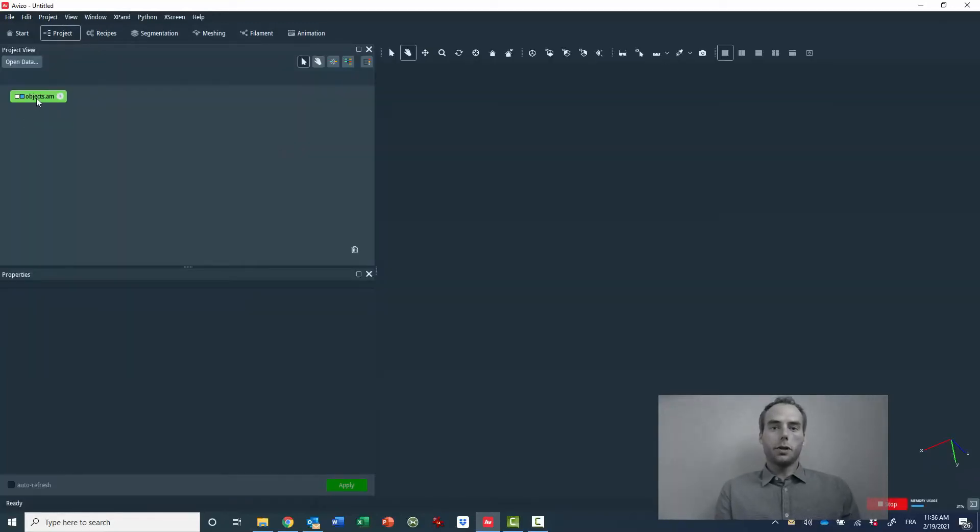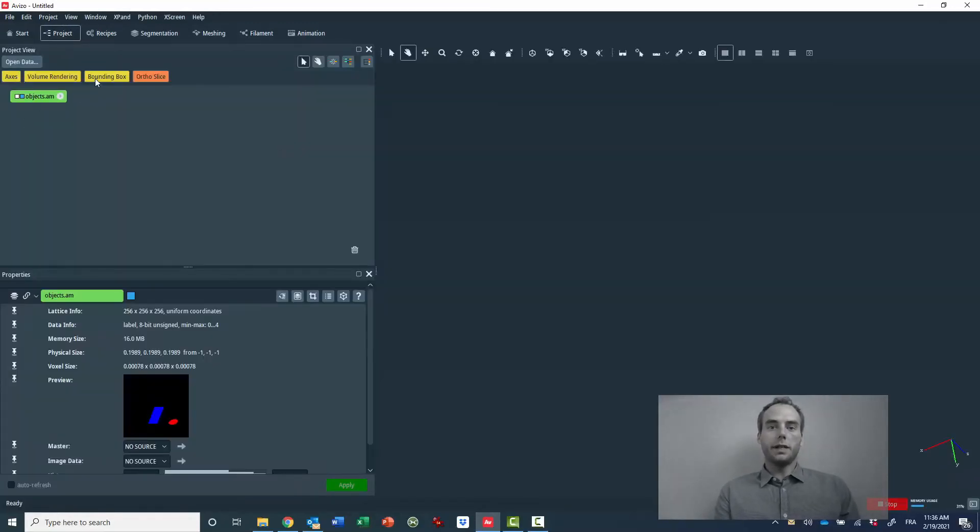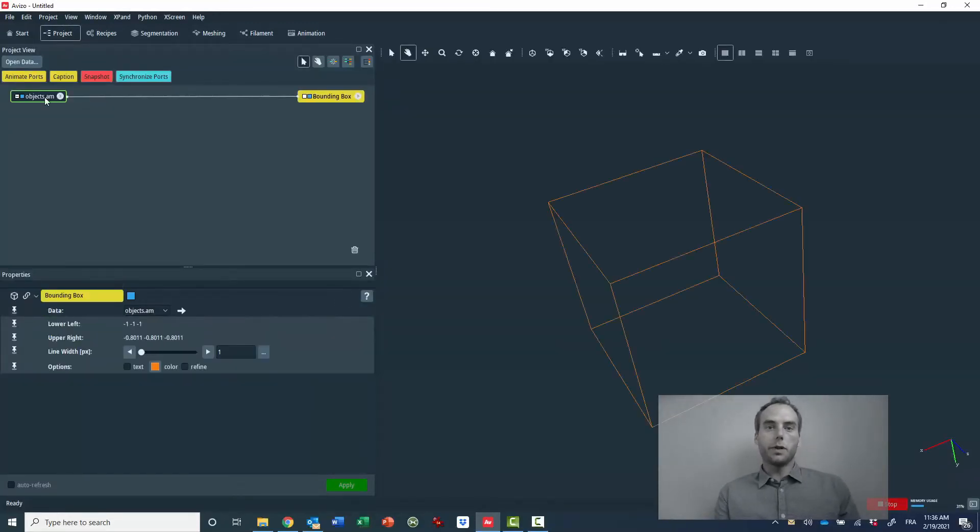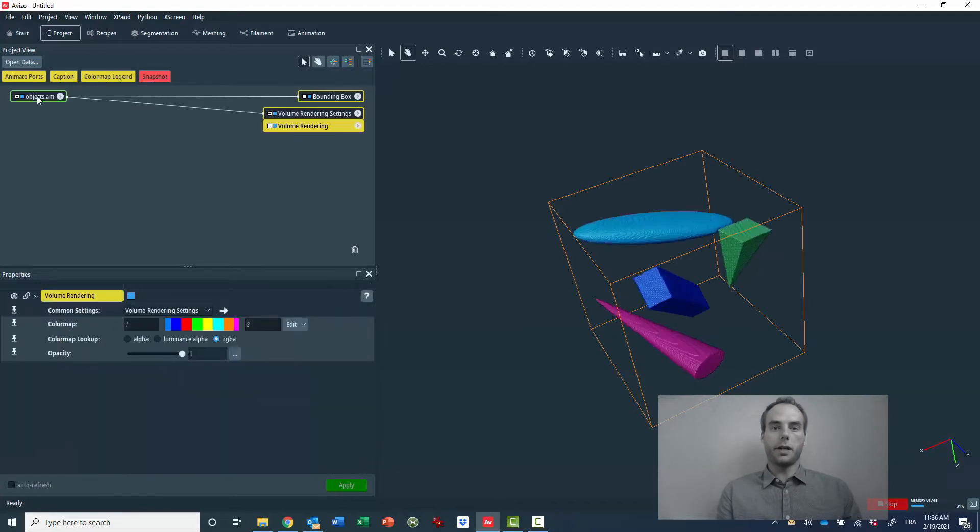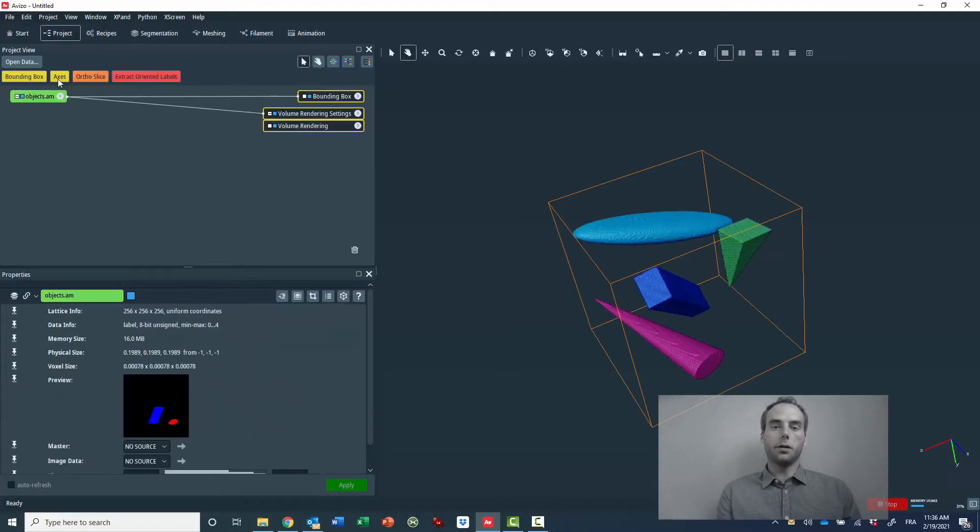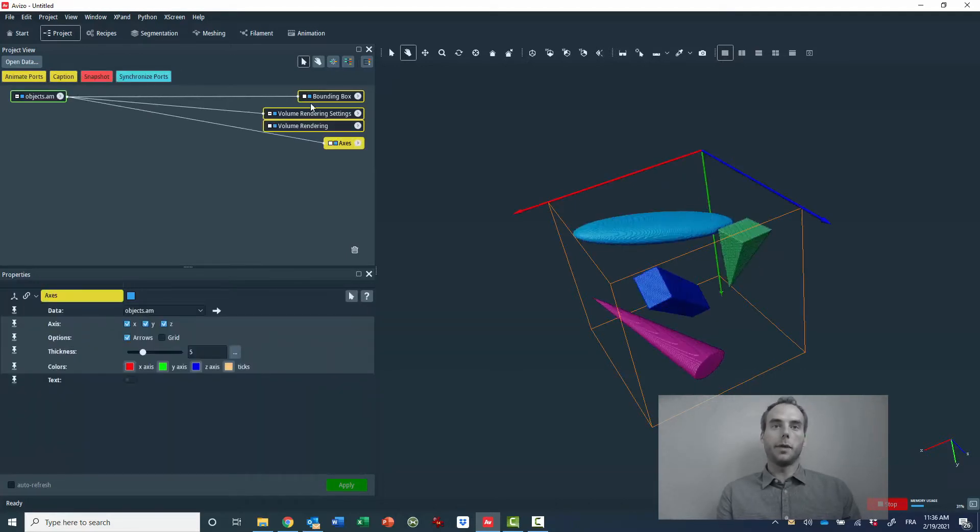Hello, today I'm going to show you how to easily extract and resample volumes along their main orientation from a label image.